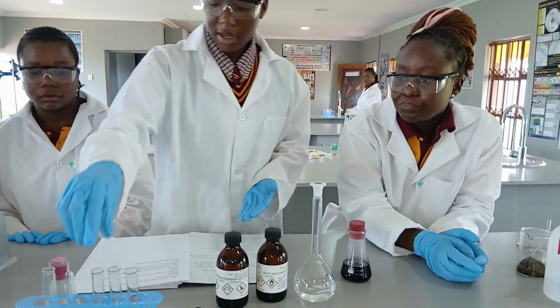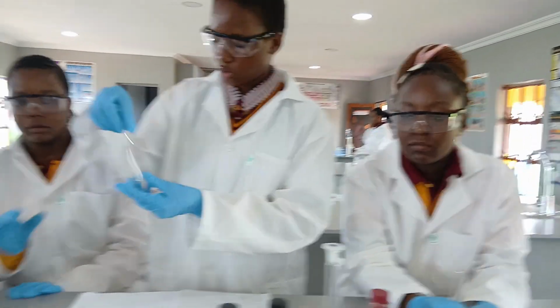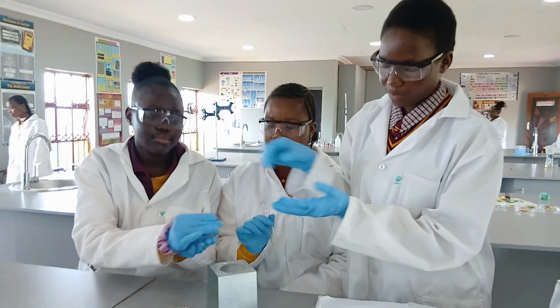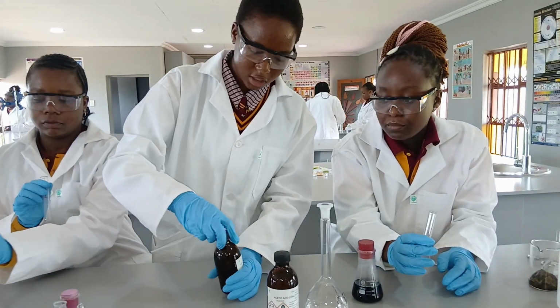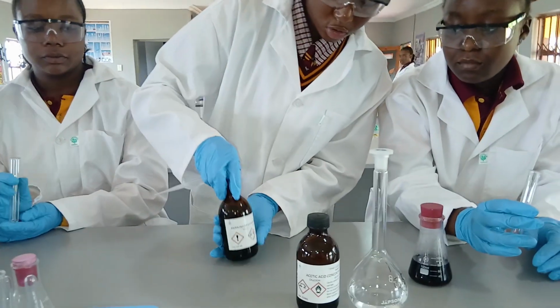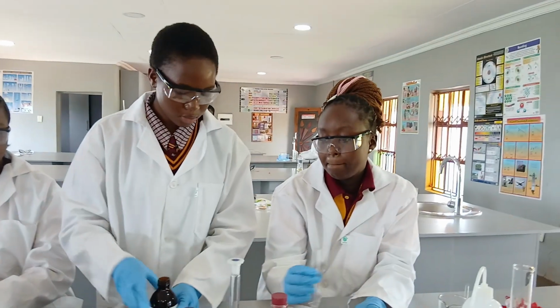So we're going to have our test tube 1, test tube 2, and test tube 3. So I'm going to pour a little bit of our solution into each test tube. Now we're going to pour our ammonium hydroxide into our test tube 1.